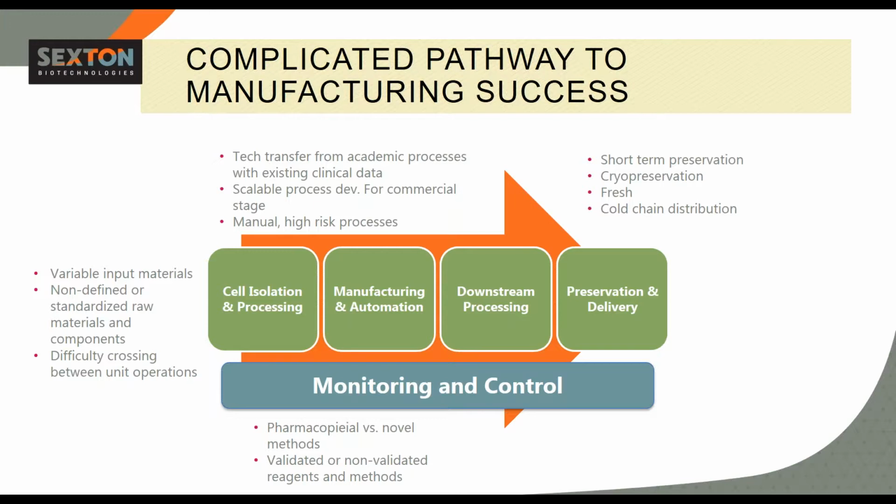And I think whilst each therapy developer will likely have their own specific needs within such challenges, as tools providers, I think it's really key that we develop technologies with that flexibility to address each of these individual needs with an industry-wide solution. I think as Dave mentioned there, historically what has happened is that processes have had to adapt to fit within automation. And I think we do really need to flip that. Next slide, please.